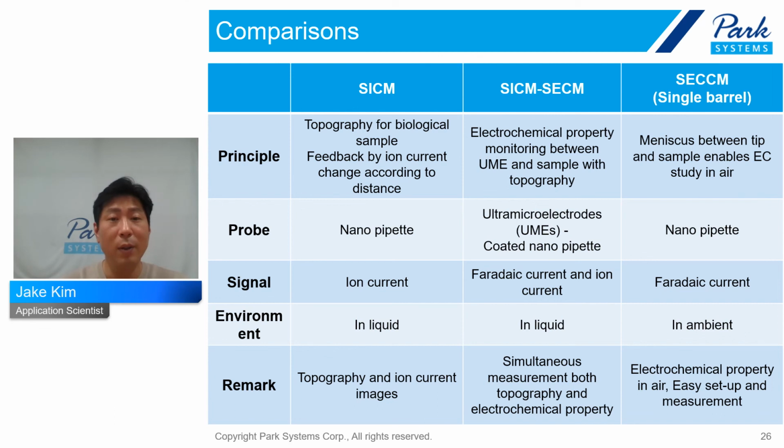For example, SICM is a non-invasive, non-destructive technology specialized for very soft samples. SICM-SECM can measure EC activities together with the SICM technique. And SECCM can measure EC activity in ambient conditions.